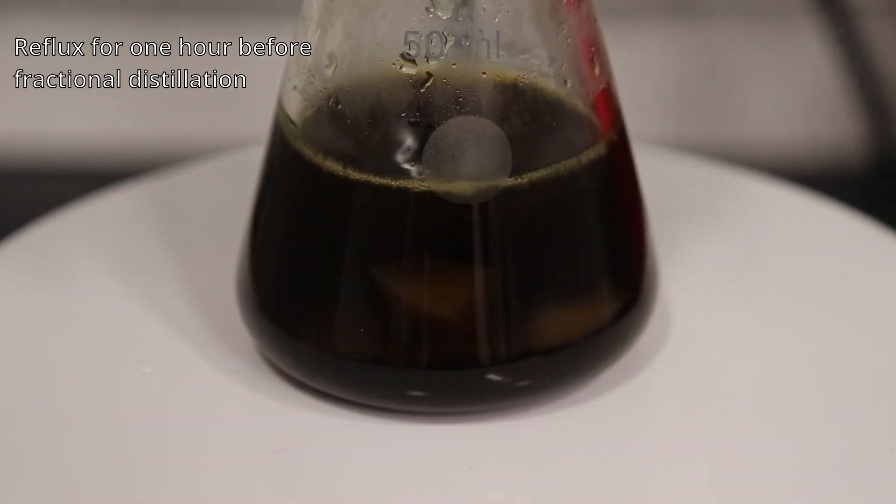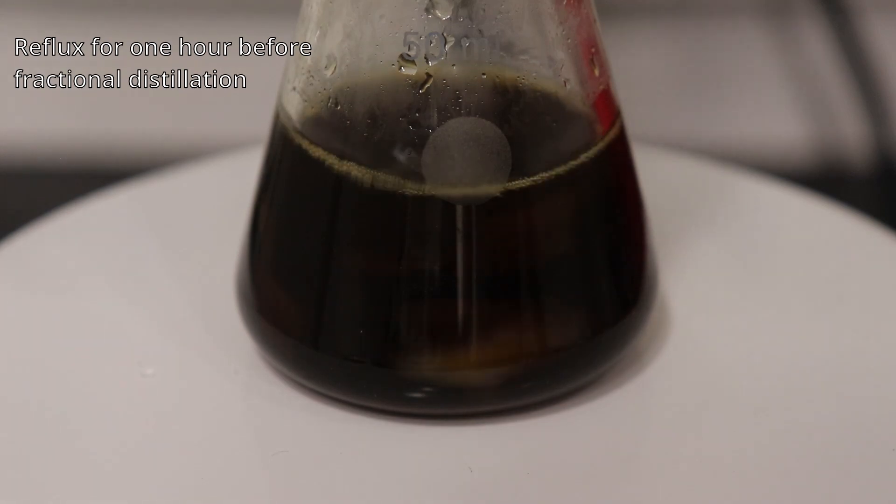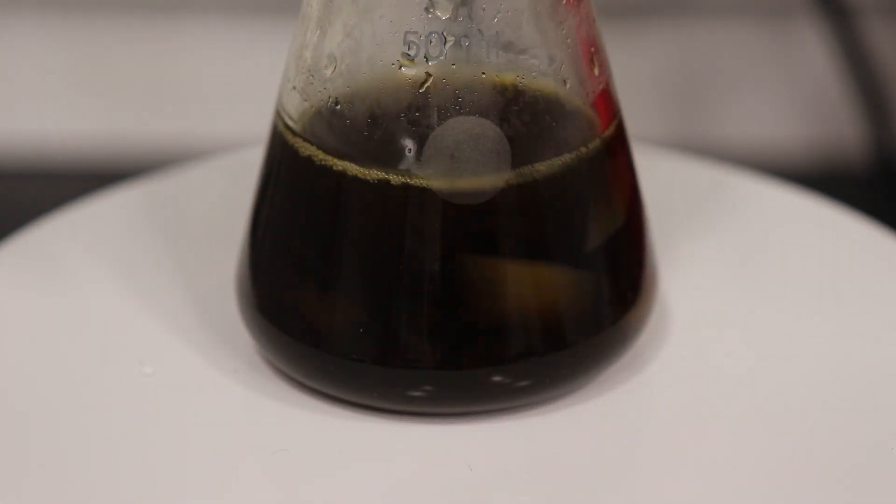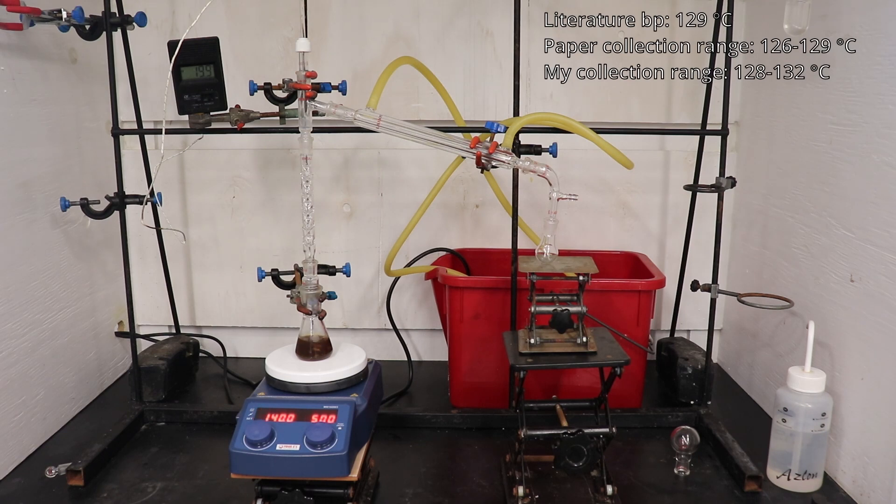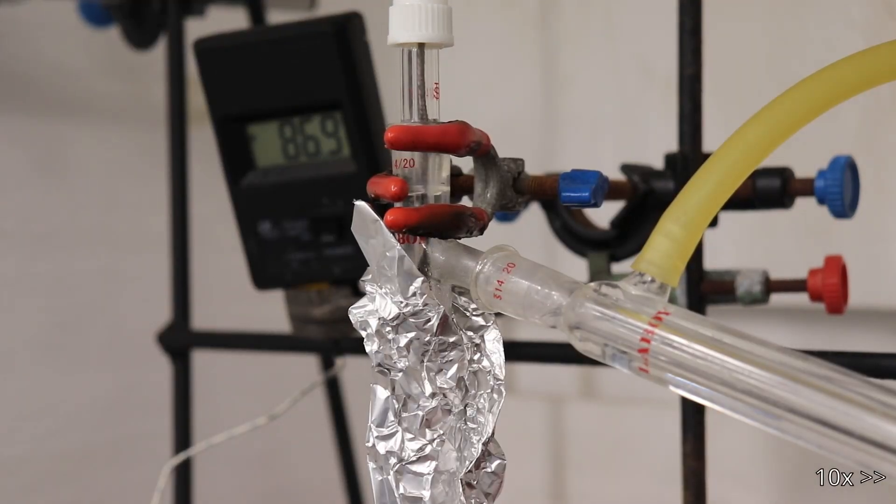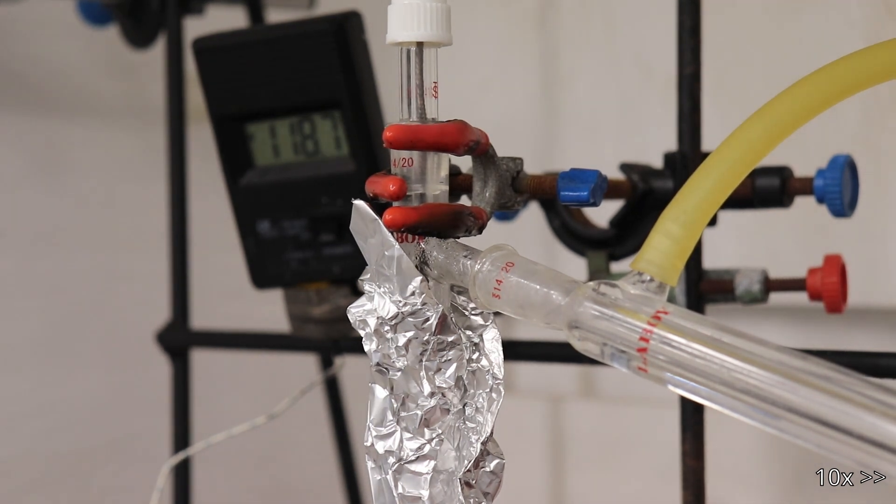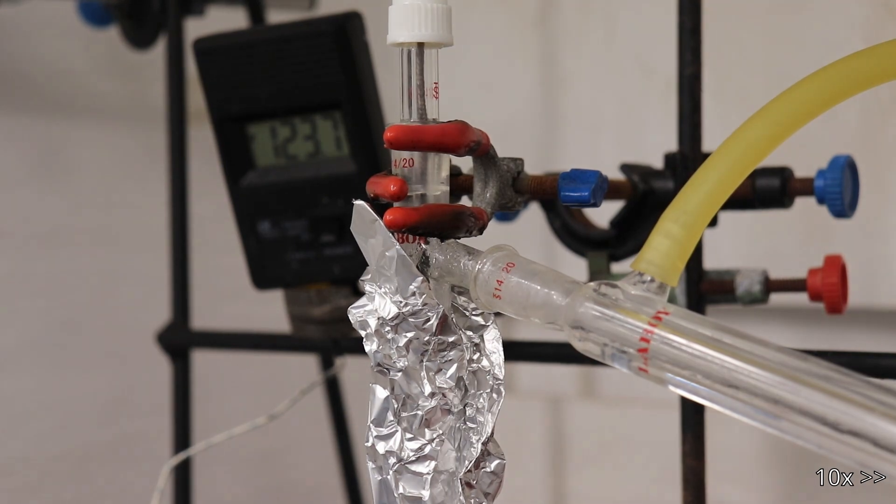The apparatus is then reconfigured for fractional distillation. The theoretical boiling point of morpholine is 129 degrees Celsius, and the paper I'm following collects the product in a range of 126 to 129 degrees Celsius. However, I found that the product distills over at a temperature range of 128 to 132 degrees Celsius. The recovered distillate had a mass of 20 grams, which represents a 39% yield from diethanolamine.